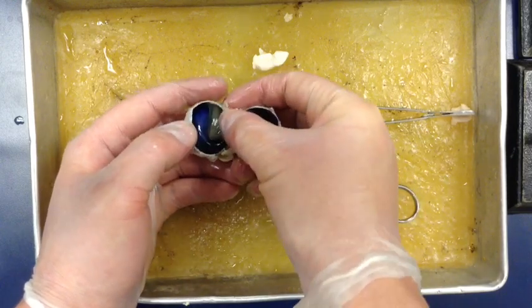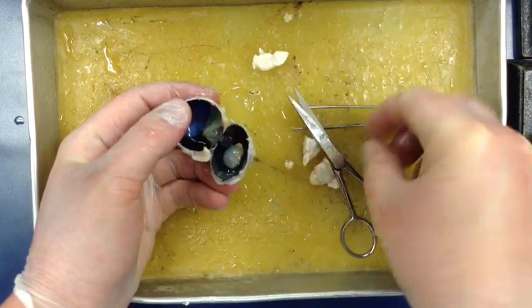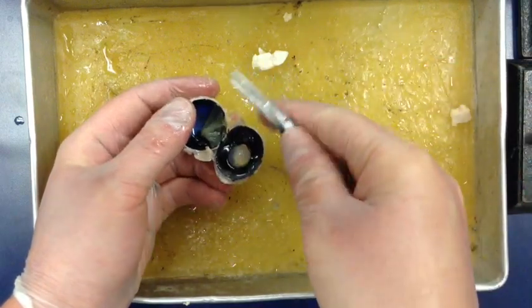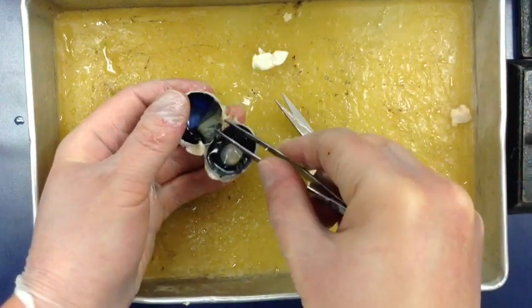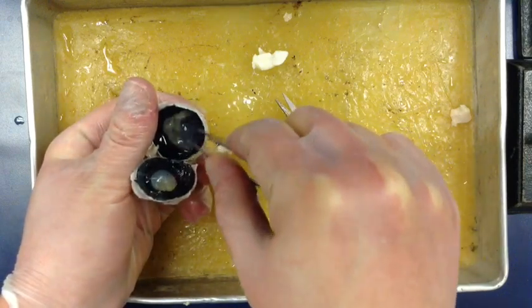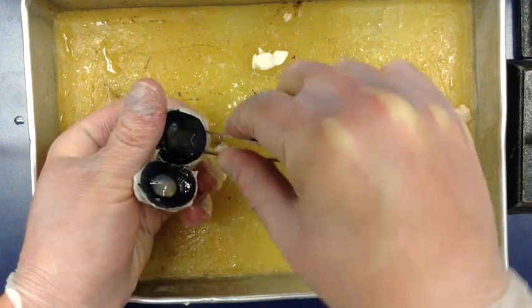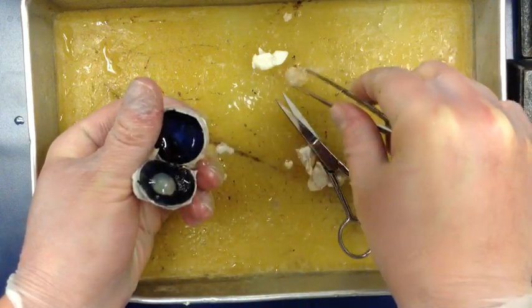Now we're going to look for a few parts. First, let's look at the back - this is the retina. This thin layer at the back is our retina, and it's actually connected right at our optic nerve. We can go ahead and pinch it and pull it off - that's our retina.